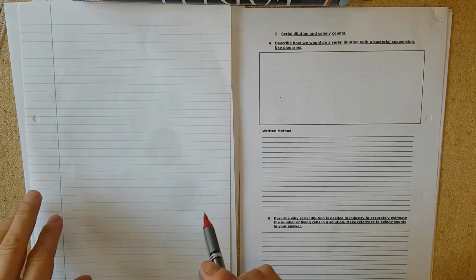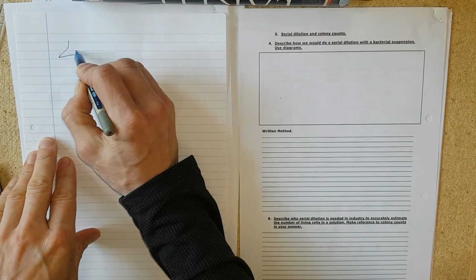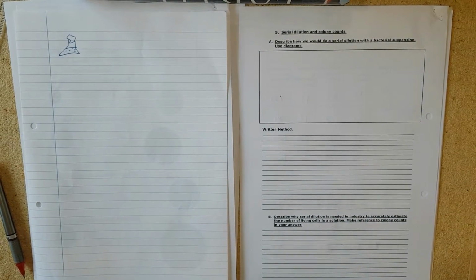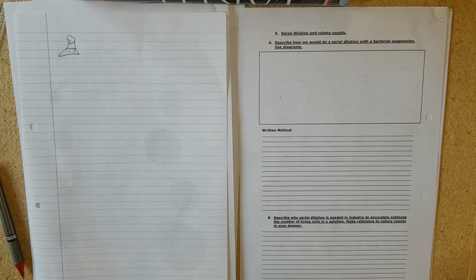Right, number 5, the last task for D2 is to talk about serial dilution and colony counts. So here's a little explanation. We're going to start off with our culture. There's our flask with some cells in, and we don't know how many cells are in there.